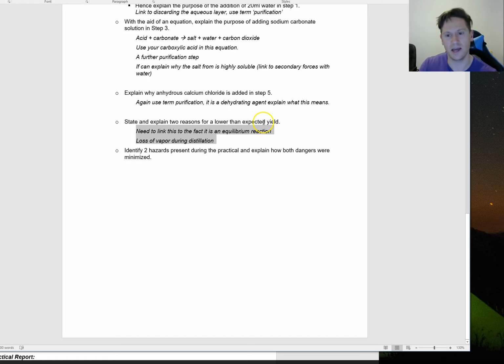So you're not going to get that. I think it's 65%. You may need to research it. Why aren't we getting that level? If you get over 65% yield, you've stuffed up your calculations somewhere. Okay, so why are we lower than that? Linking to aspects of the experiment.